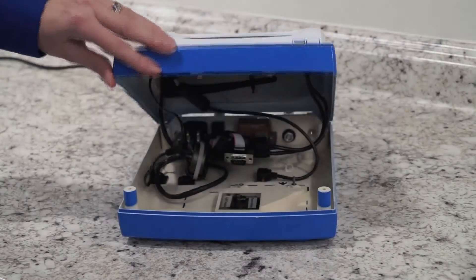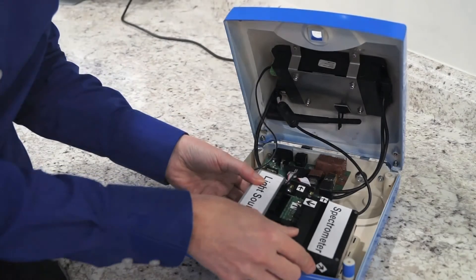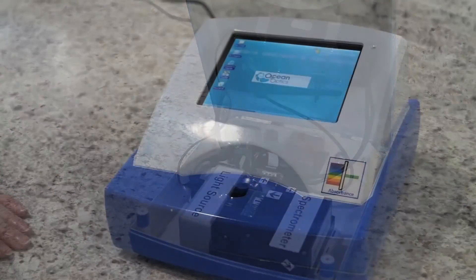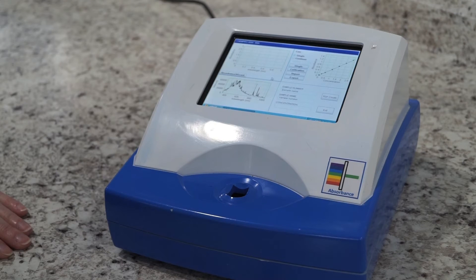At the next level of integration, a custom CCA is added to control the light source and spectrometer. This can be customized to include thermistors and fans for temperature control, wifi or ethernet for remote communication and more.